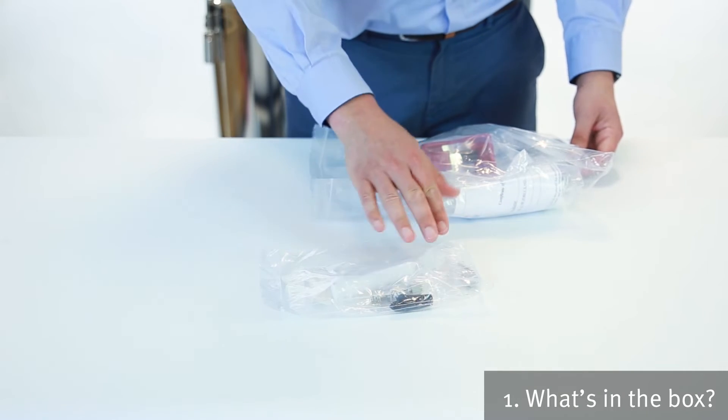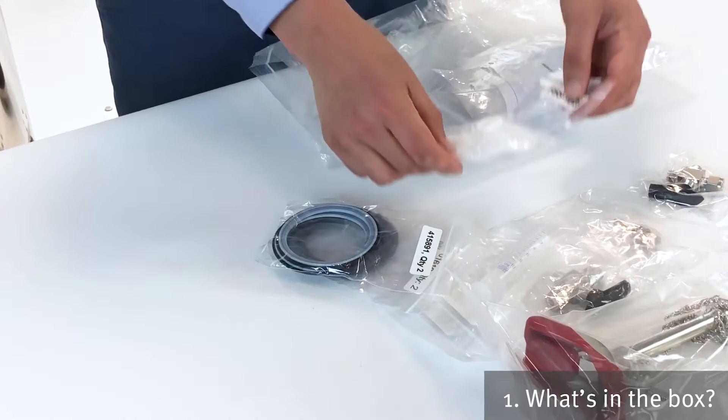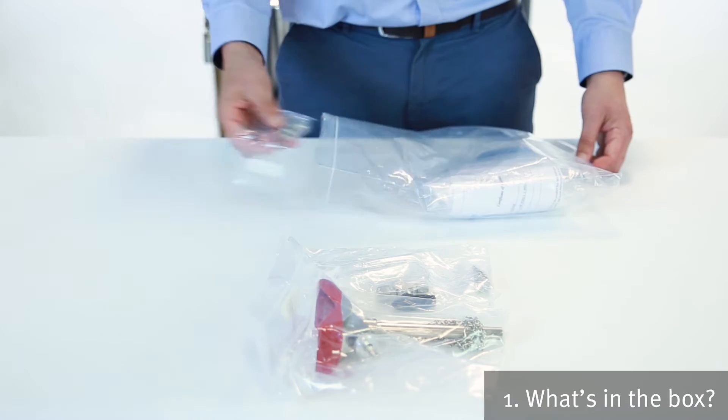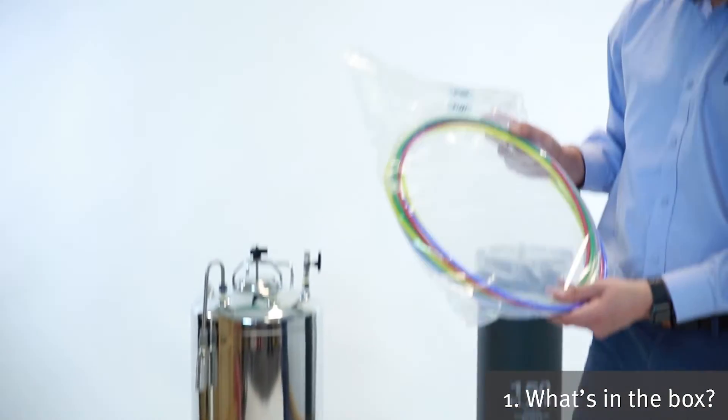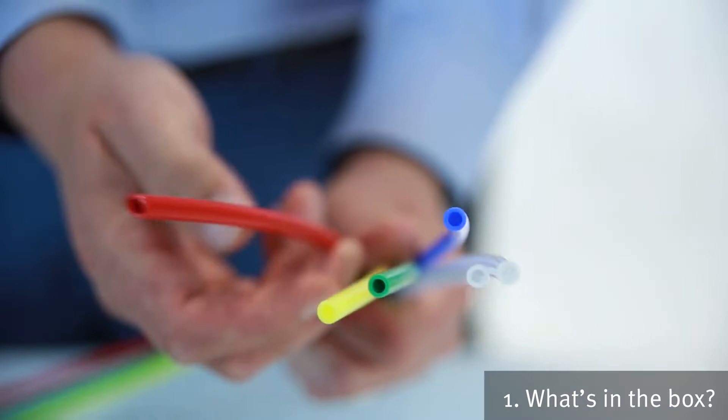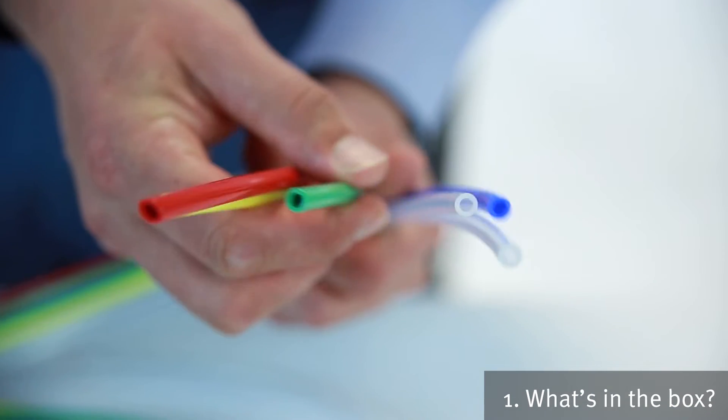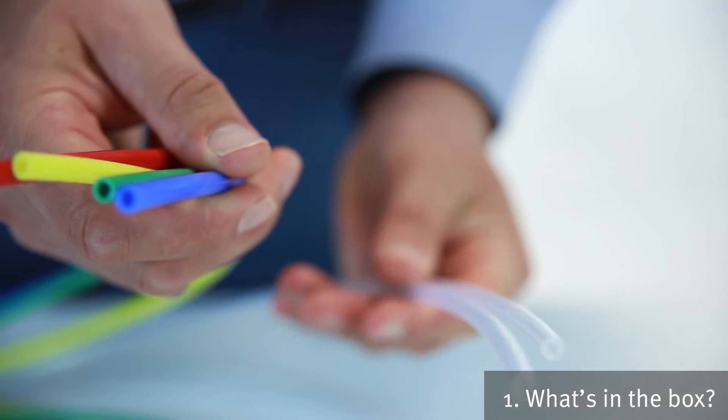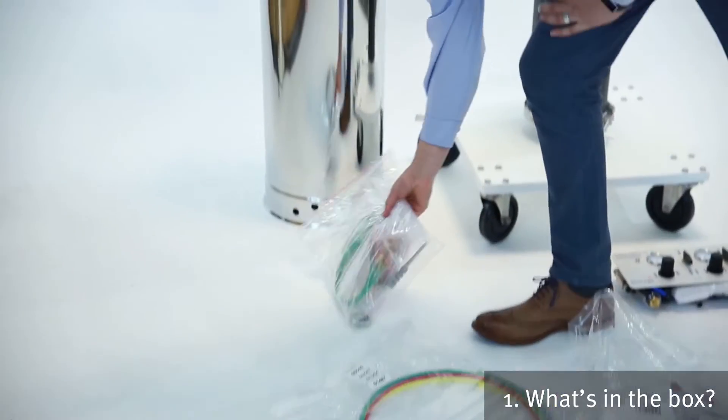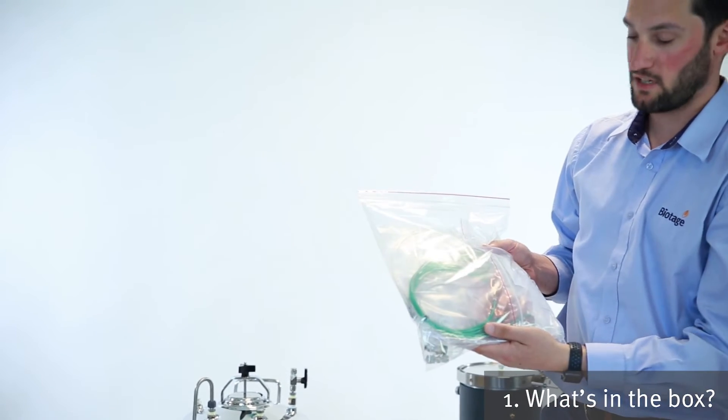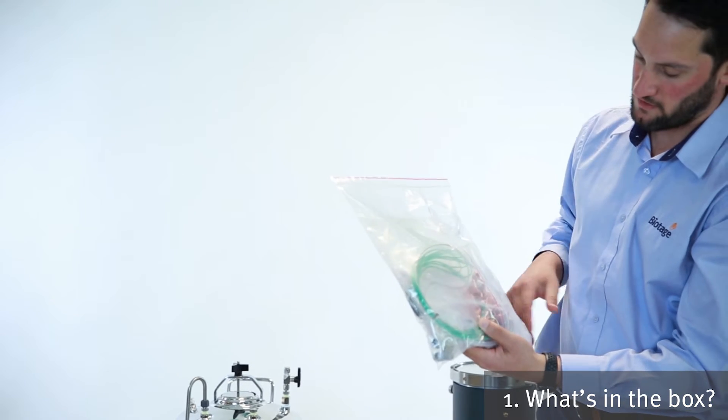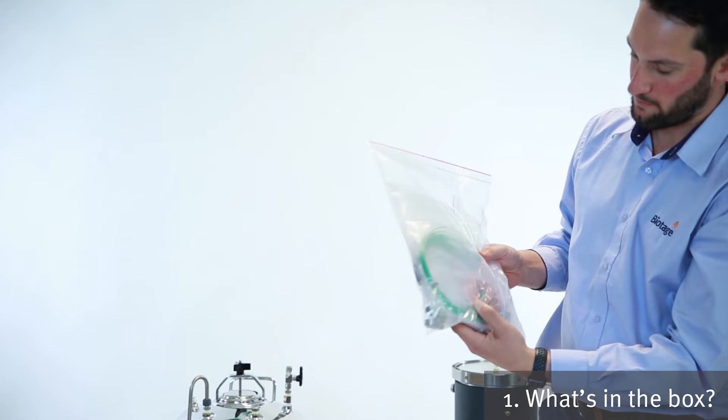We've got a three-way valve. We've got a set of gaskets and seals. Another three-way valve. Also here we've got a variety of different types of tubing. The gas tubing which is colored and the solvent flow path tubing which is clear. Finally, and from a safety perspective very important, we've got the grounding kit. You've got a selection of different types of crocodile clamps there.